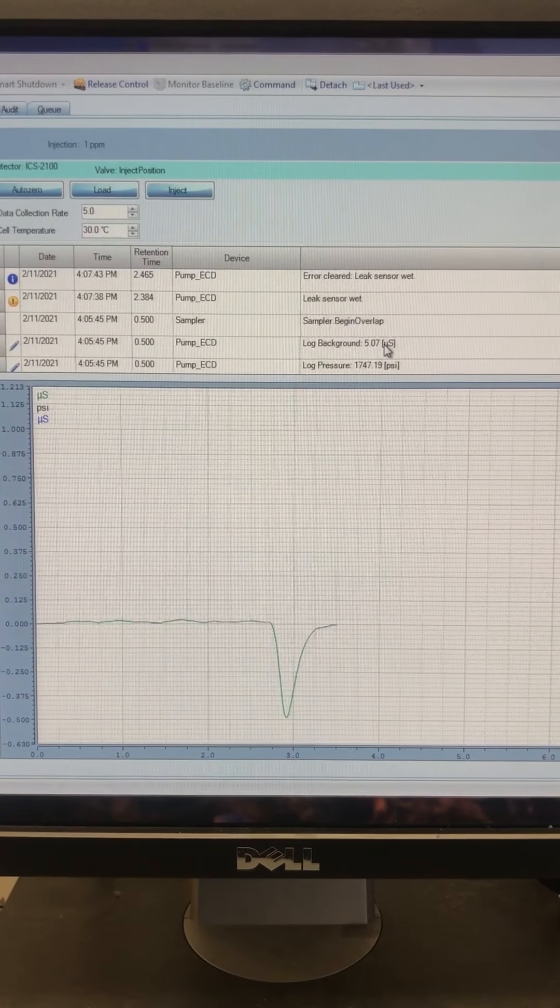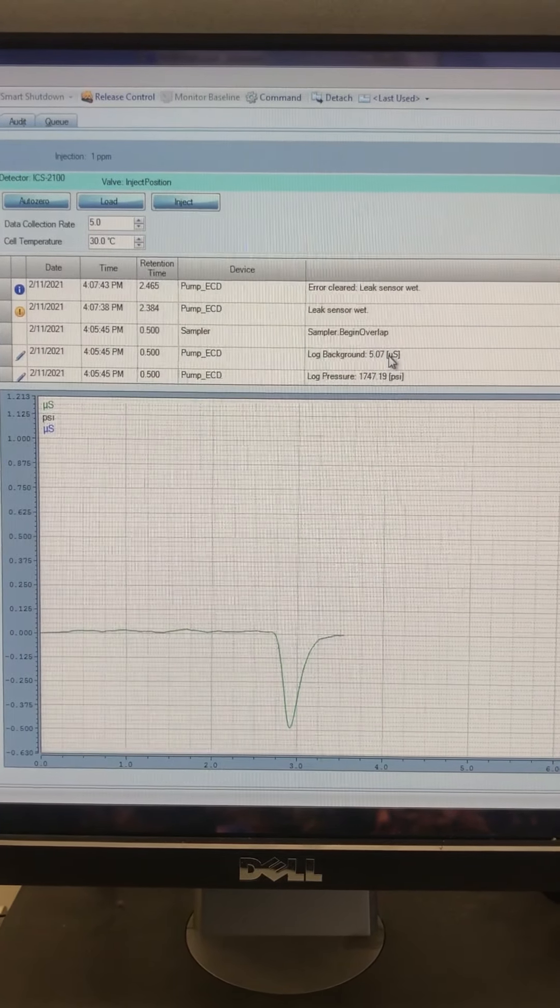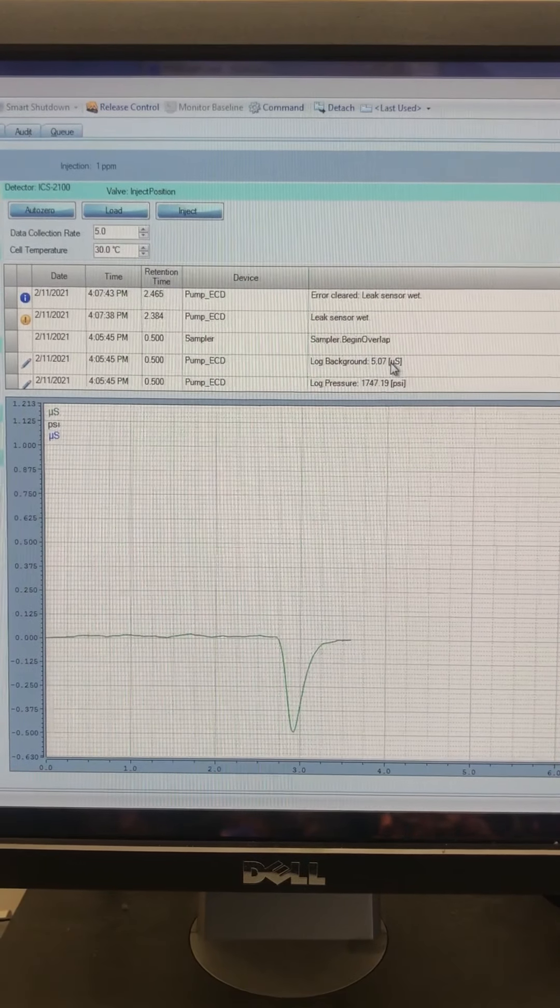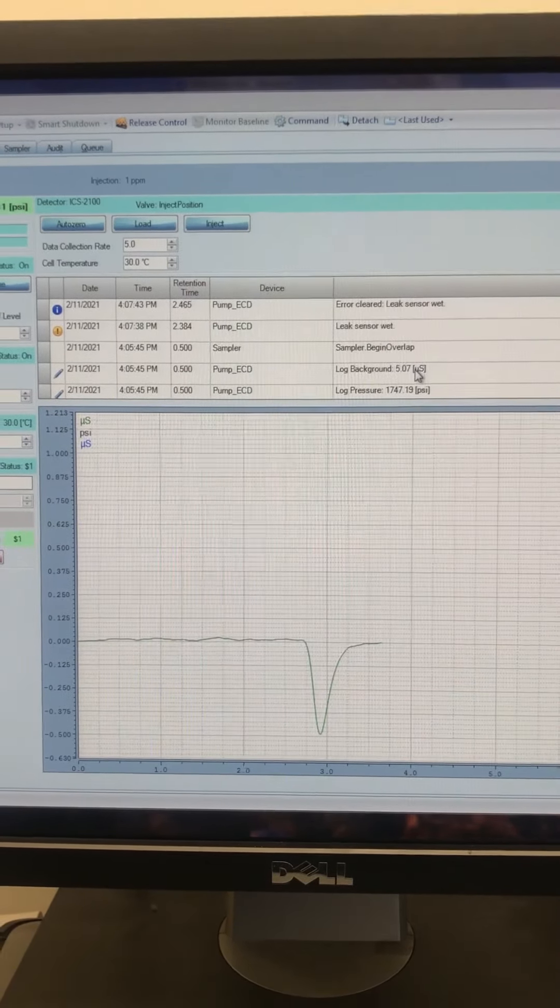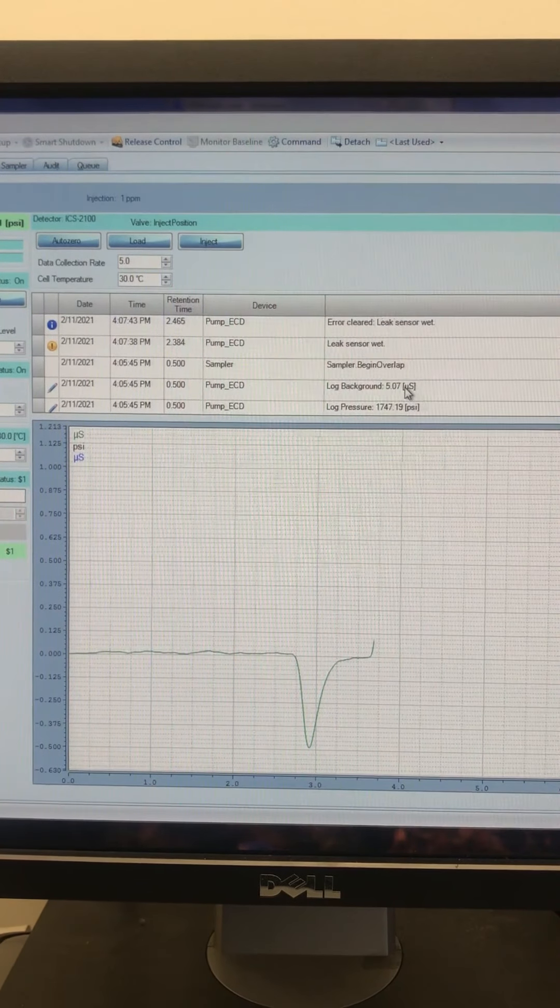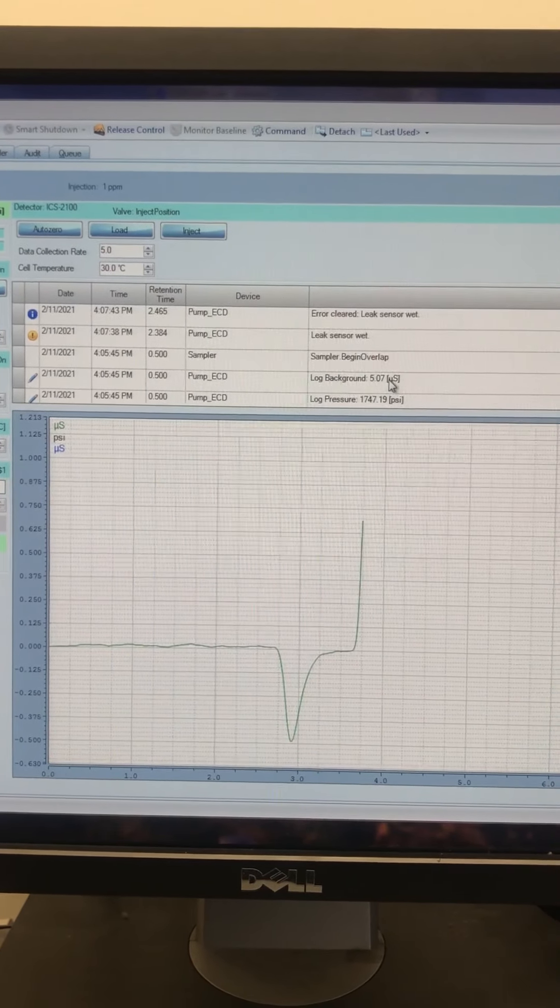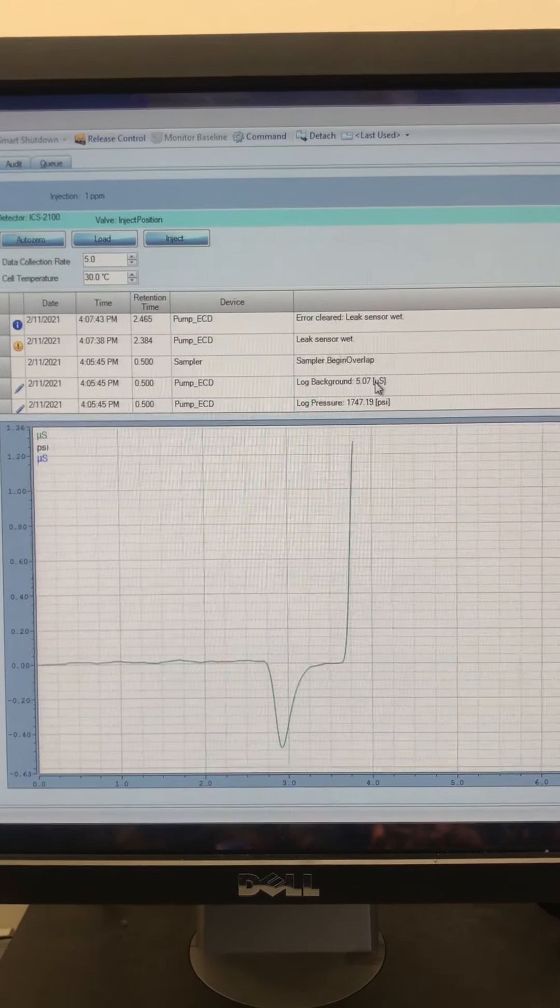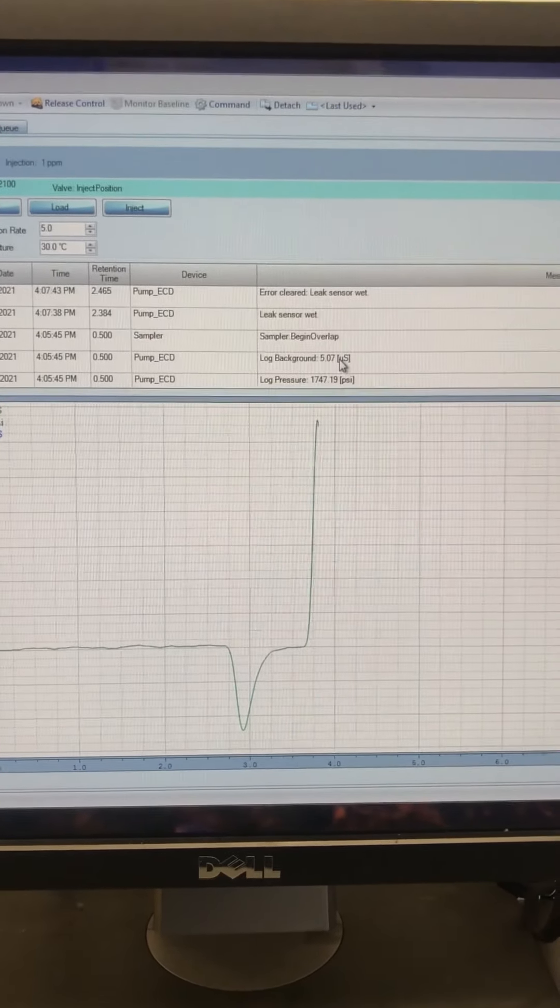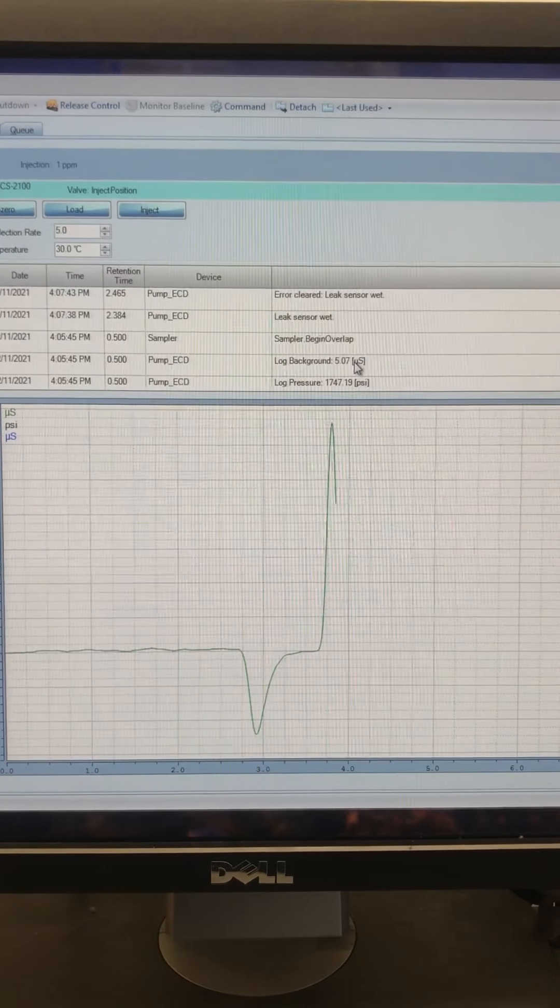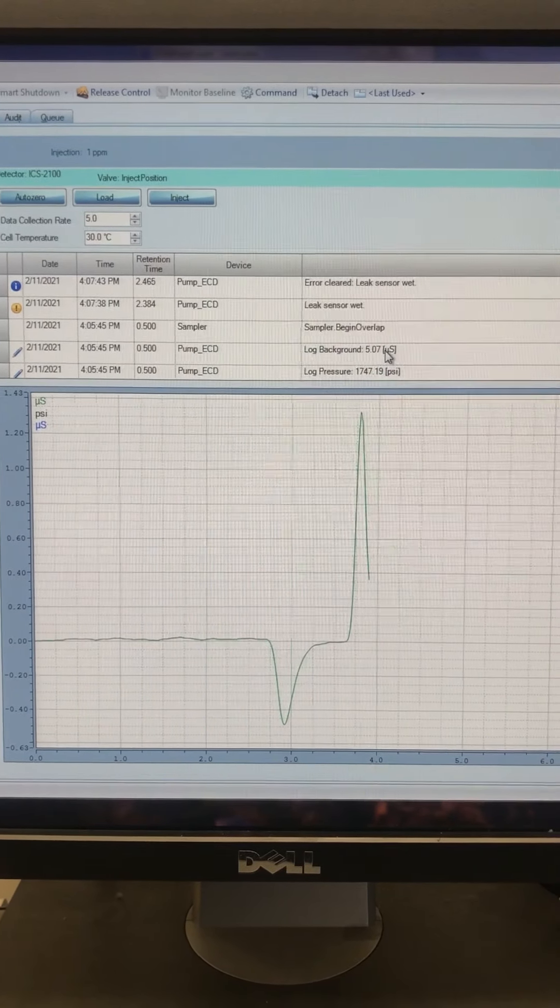I typically will start it and then come back the next day to check all the values and get that data onto a flash drive and bring it home to do some data analysis. But while I'm here, I always like to watch a couple samples run just to make sure the machine is working properly. It looks like things are going really well so far.